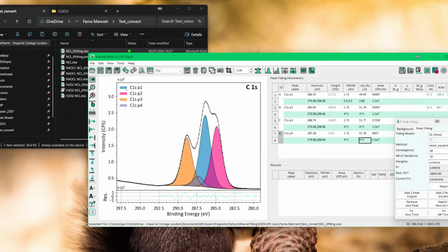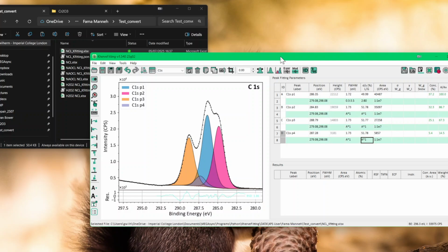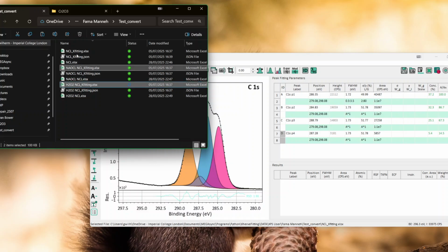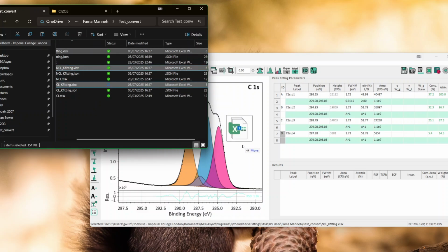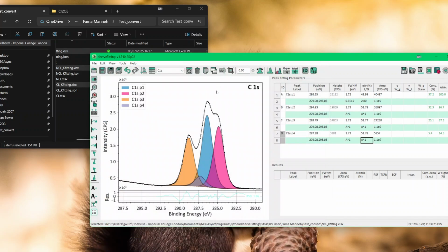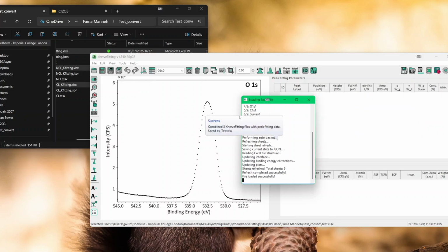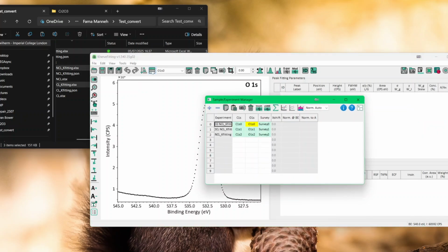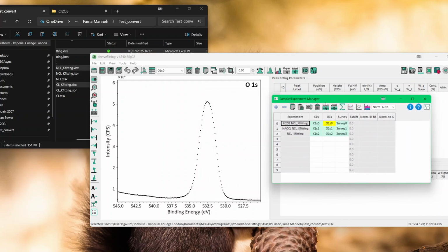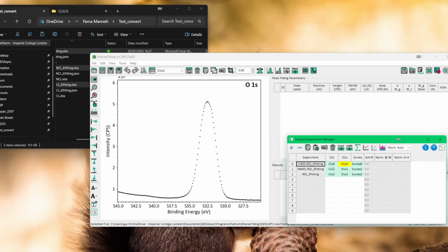And what I want to show is now if I use the KFitting Excel, those ones, I put them together, then I'm creating a single file and I will call it test. A single file is going to be made of all those files. So 3 files into one, and that enables you to compare. And even, and that's what I was trying to show, even the peak fitting is preserved.